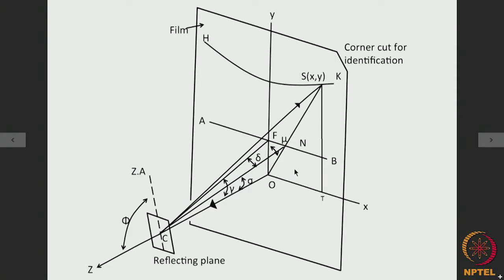Say for example, here we show schematically, so this is the direction of incident X radiation along OZ, and here we have got our sample, and say this is a particular plane within the single crystal sample which belongs to a zone for which this is the zone axis.